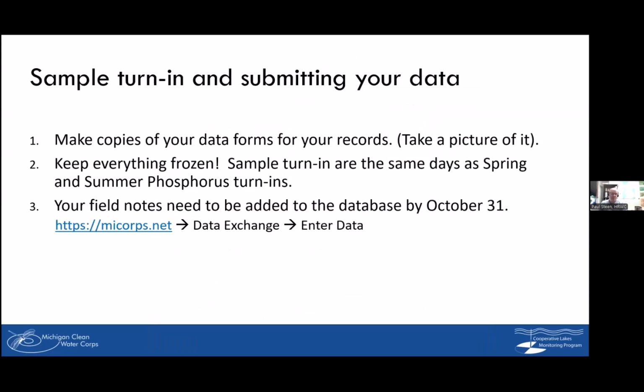Okay, so when it comes to sample turn in, make copies of the data forms or take a picture of them with your phone for your records. Keep everything frozen. So you're going to put all of your filters in these little tubes, just one filter per tube, and you'll have the labels on them. They all stay in your freezer, and you have to keep them frozen. If they thaw, they're going to be worthless. So you keep them frozen.